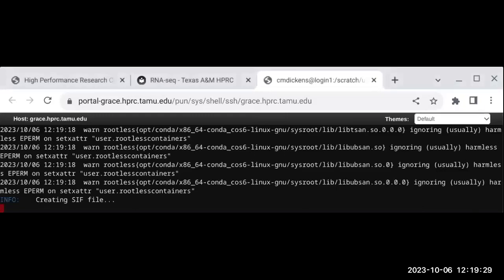Okay. See, it's still going. That way, if I need to go to class, I can just submit the job script and come back and it'll be done. The job script runs while you're away, right? You can disconnect from your session. All right, so it's creating the file. Is anyone running this? Still creating? It just finished. Okay. All right, well, that's still going.